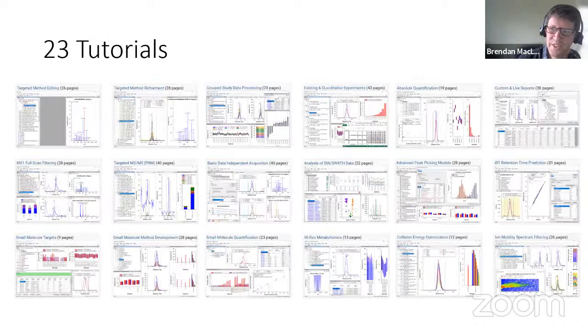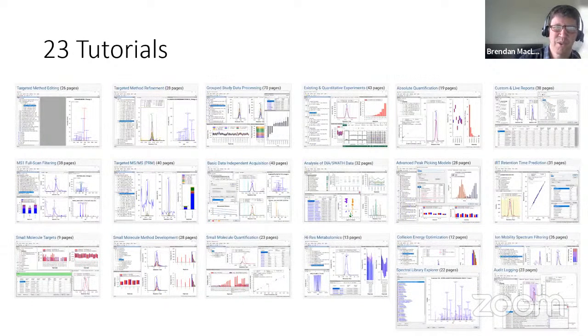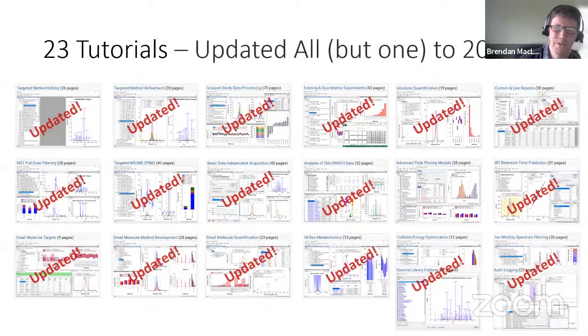So there are now 23 written tutorials, and there's a couple more getting added. We're adding them all the time. We went through a major push during the pandemic to update them to recent software, because some of them were getting a little long in the tooth. So if you go and use them now, they represent our best effort to update and write about the most current best practices in Skyline.